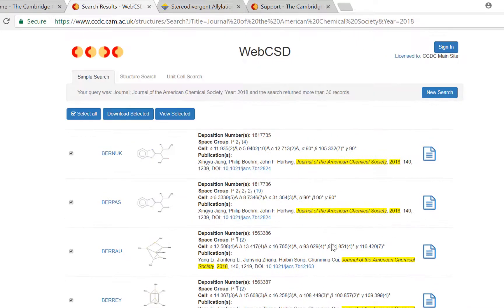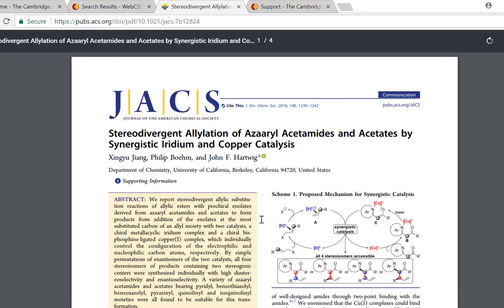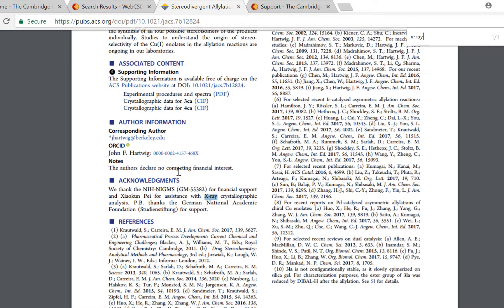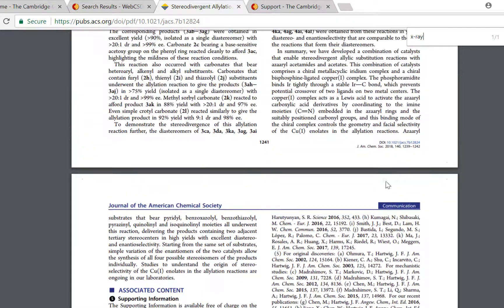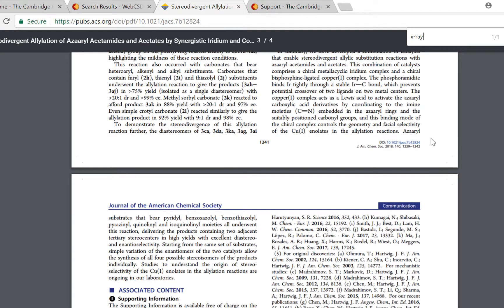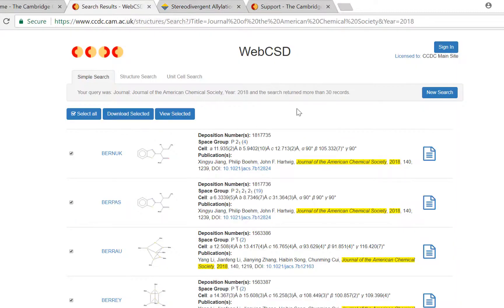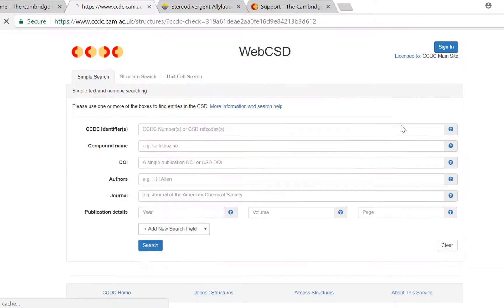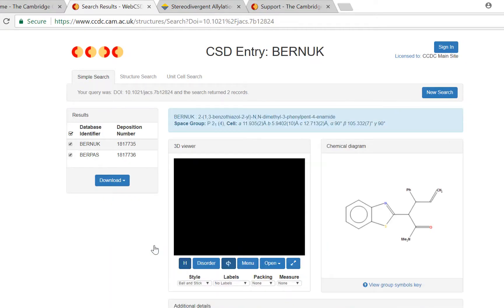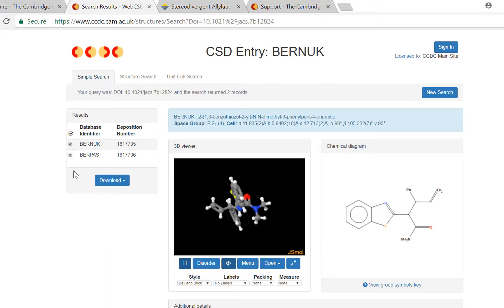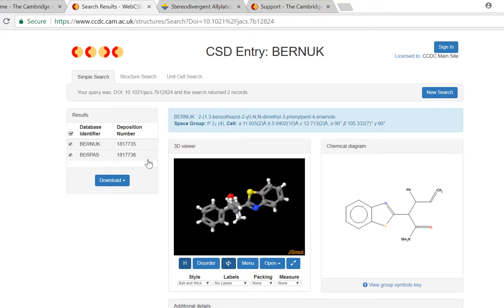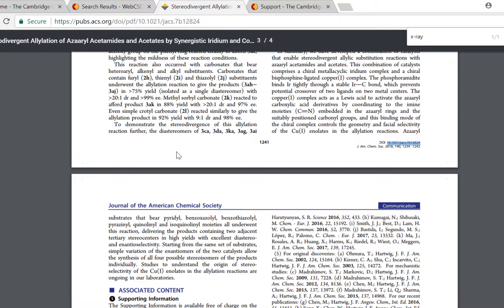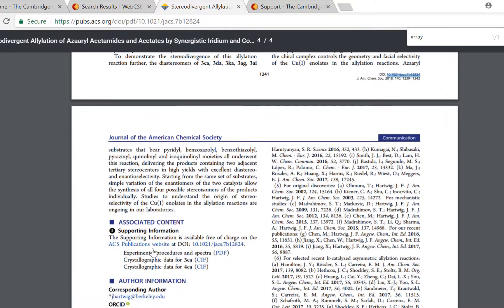So what if you already have a publication with crystal structures in it that you want to search for, such as this example here? You can copy the DOI from the paper and enter this into the DOI search box. Then you'll see the results of all the crystal structures that are in that paper. Here there are two, which is in line with what's reported in this paper.